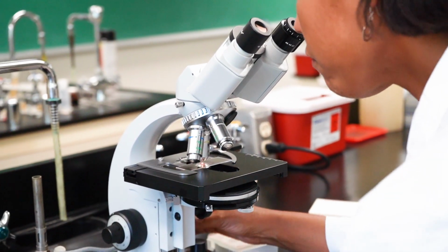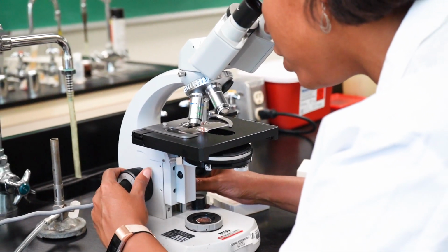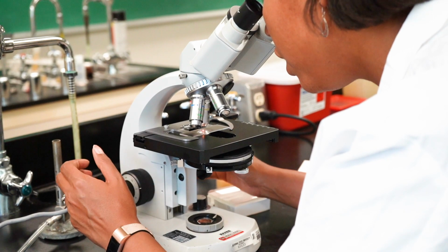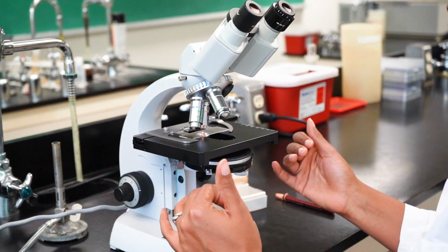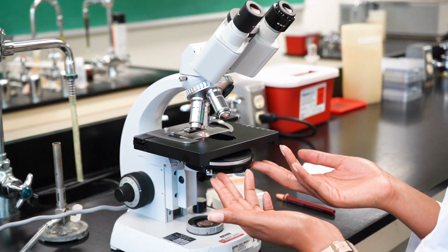And then, using the coarse focusing knob, you're going to lower the stage until the wax comes into focus. And then you can use the fine focus adjustment to make sure that the wax is clearly in focus. Why you have to make sure that you lower the stage first before you do anything else to focus the specimen is because in the next stage, we're going to start making manipulations to the condenser.